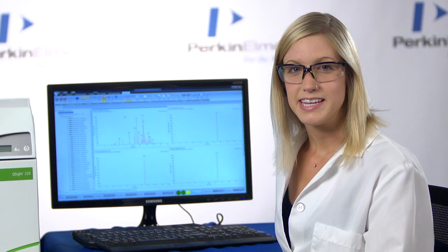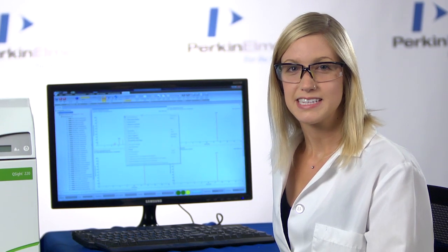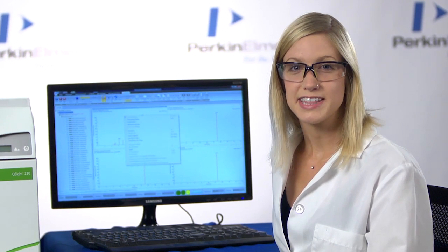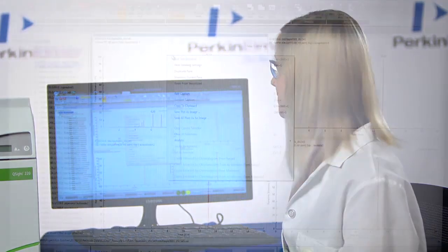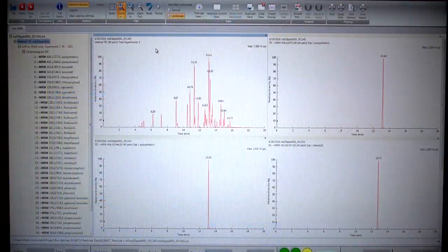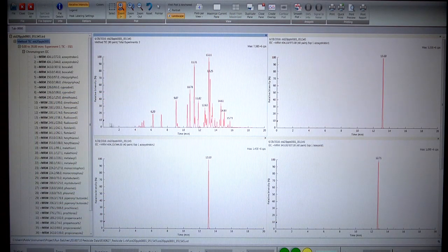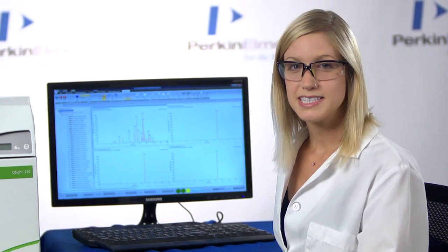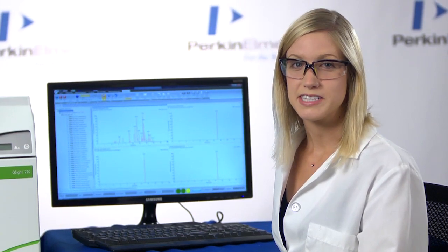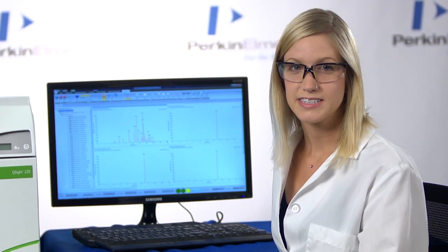Our pesticide method has now completed. Let's take a look at the data in the Data Viewer. Then, we can process the data in the Quantitation software.